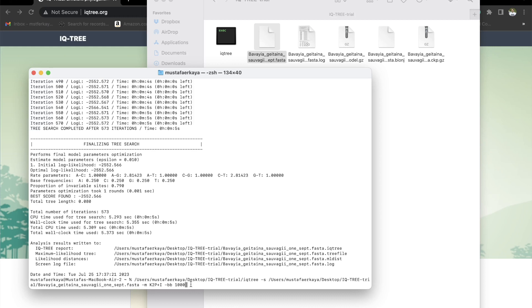The higher this number, the better it is. If you're going to be using this in a scientific article, you should be hitting at least 100,000 replicates. For this video, I'm only going to focus on 1000.